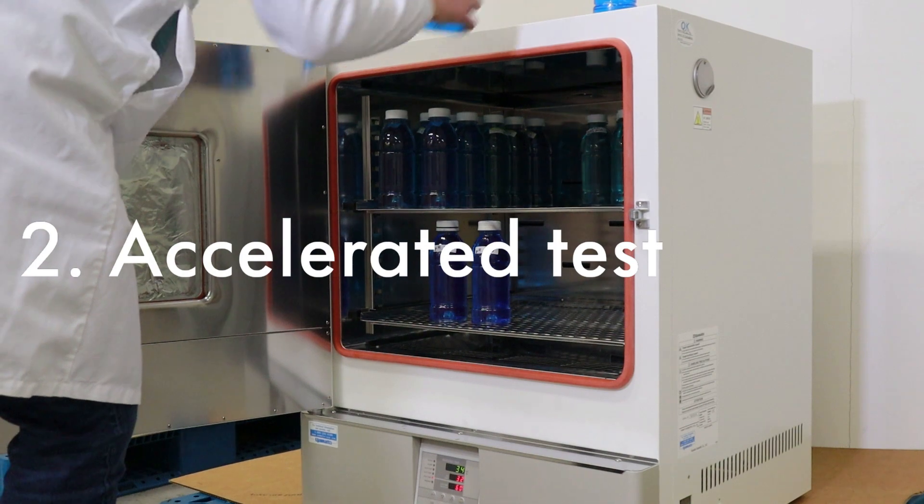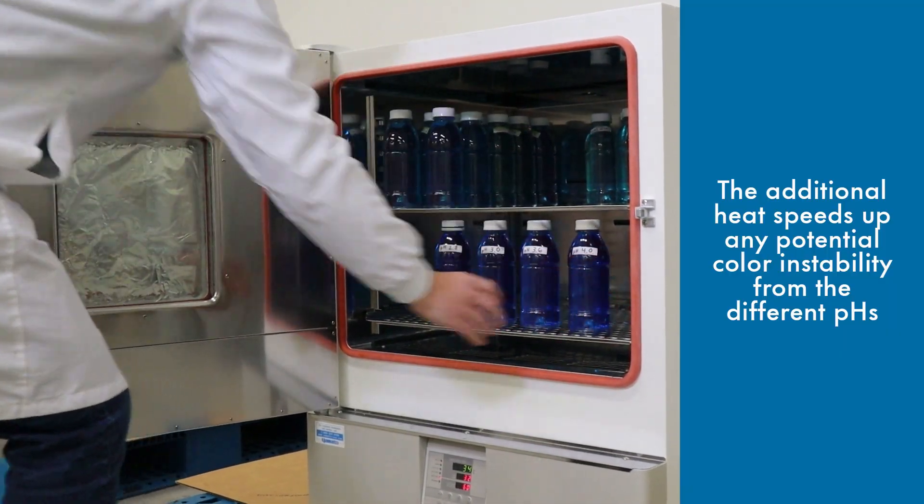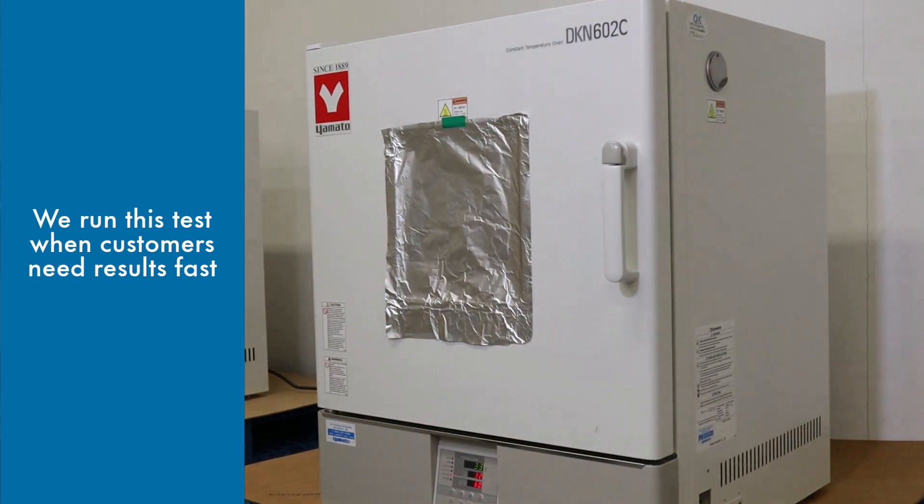In the accelerated test, the samples are stored at 32 degrees Celsius for up to 3 months. The samples are remeasured every 4 weeks to see if there has been any color change.